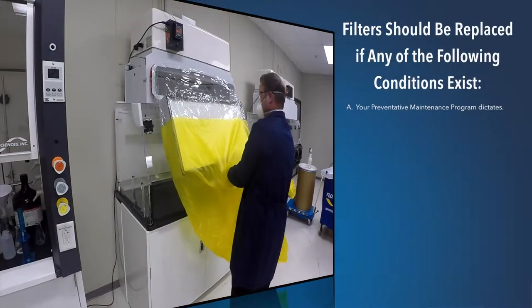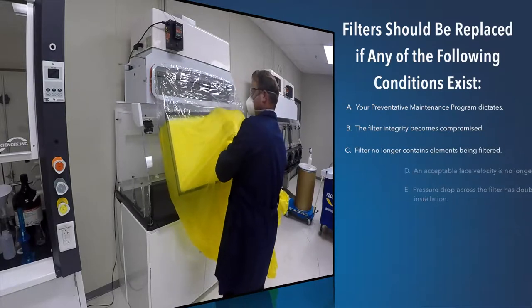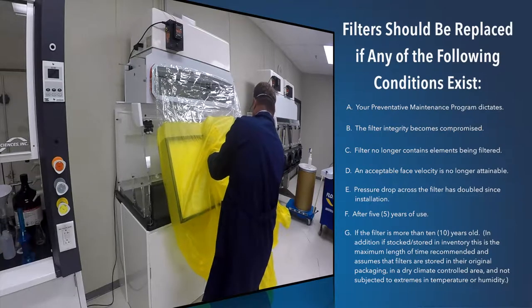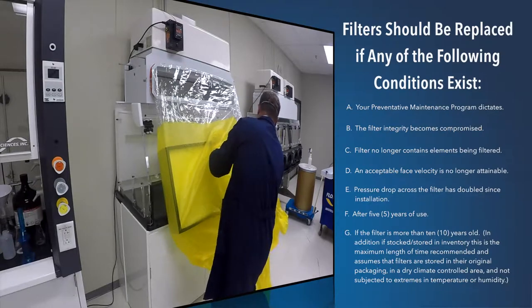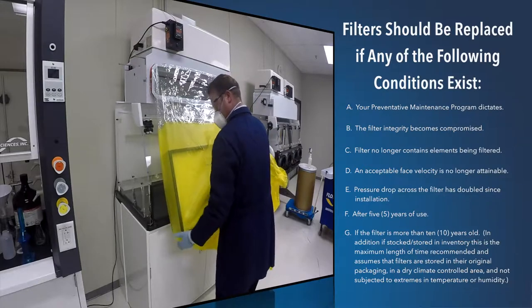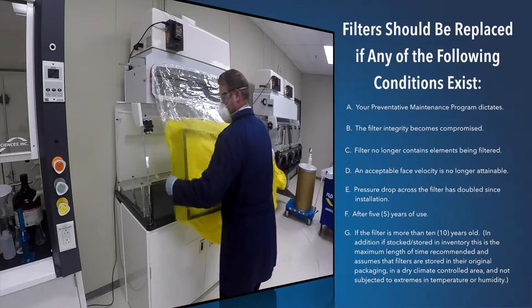Filters should be replaced if any of the following conditions exist: A. Your preventative maintenance program dictates. B. The filter integrity becomes compromised. C. The filter no longer contains elements being filtered. D. An acceptable face velocity is no longer attainable. E. Pressure drop across the filter has doubled since installation. F. After five years of use.